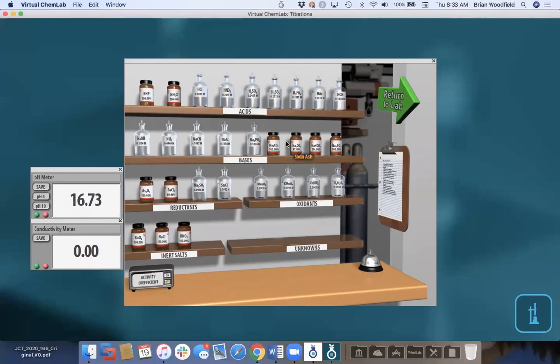So if you're wondering how we do the pH calculations, we use a mass balance, charge balance approach without any assumptions. And we apply activity coefficients as well as volumetric correction. So we use partial molar volumes and partial molar heat capacities to actually correct the volume addition and concentration levels, and extended Debye-Huckel to calculate activity coefficients. So they can do any titration.